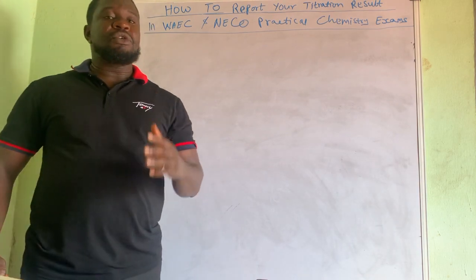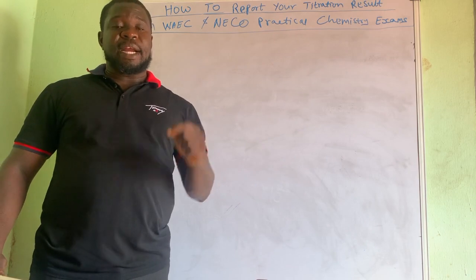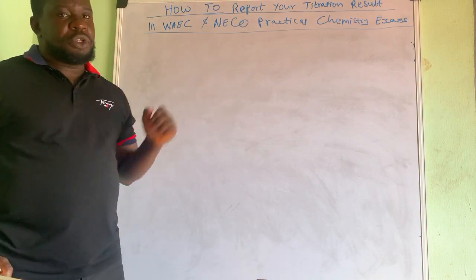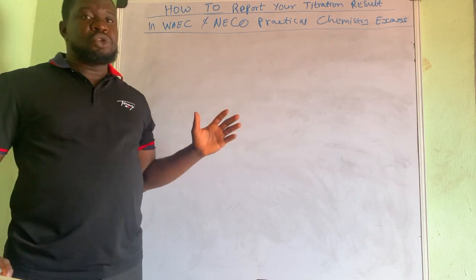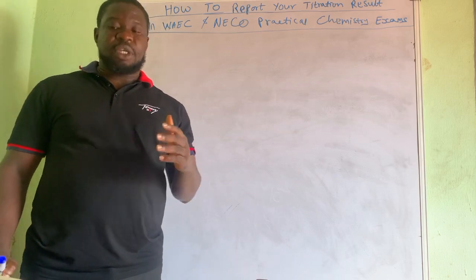So if you are going to write your WAEC, or you are going to write your WAEC or NECO practical chemistry examination this year, then this video is for you. Stay tuned as I take you through the proper way to report your titration results during chemistry practical examination.